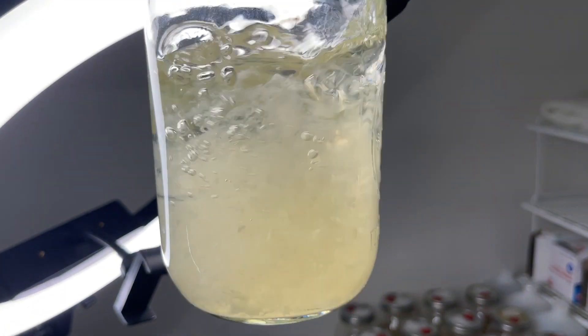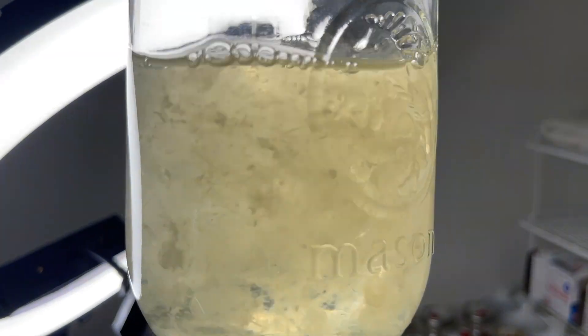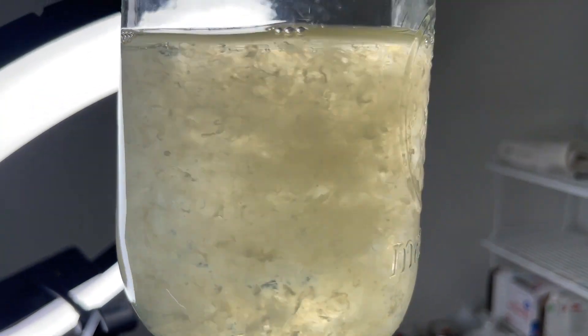Here we have a folioda namaco liquid culture, which is very thick and can sometimes appear cloudy.